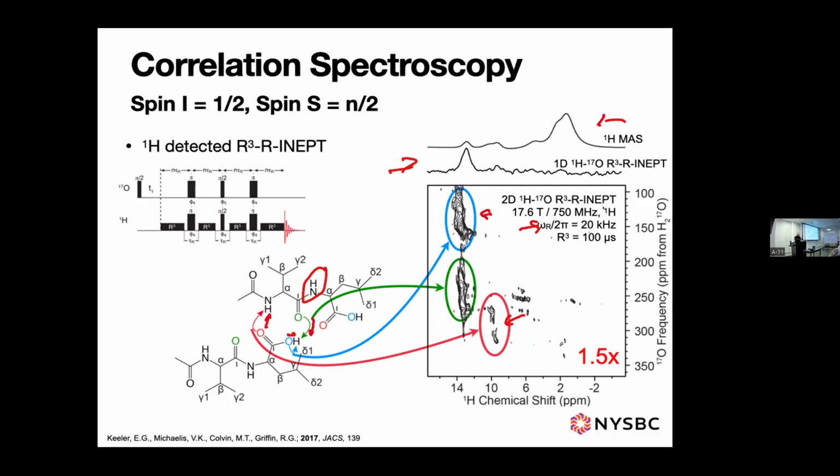And how was the efficiency when you went to proton instead of carbon? It's still very poor. So that's the problem. You can see that this is very low signal to noise, lots of noise in that. If you plot it out, it looks a little bit better because we don't have quite as much noise on all the spectrum, but we're really into the noise here with that amide peak.